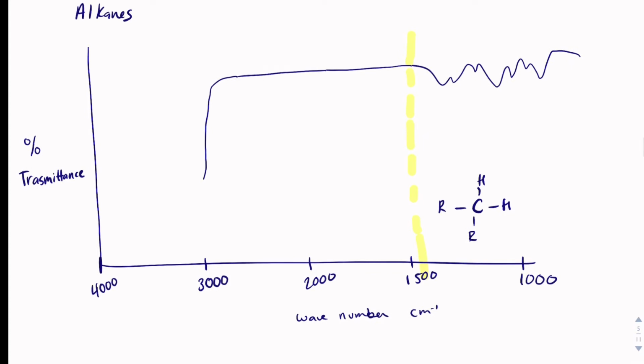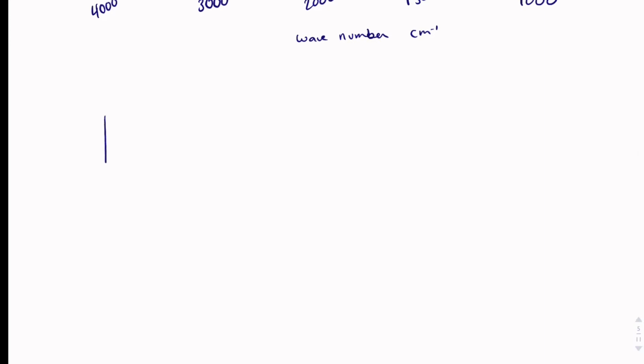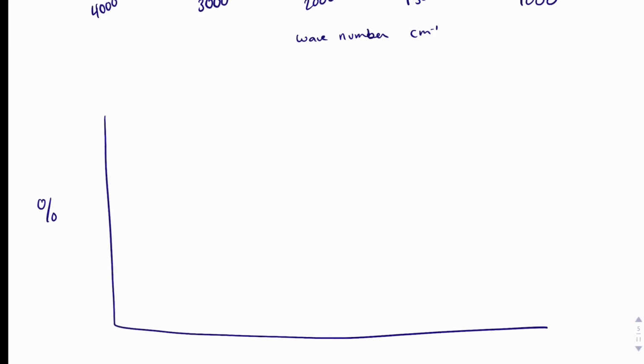At around 2900 to 3000, you'll see some squiggles, and it might look like this. This is what we call alkane stuff. I don't know if that's a very scientific term, but that's what I call it. It's basically CH. Notice how I had single bond C, then H. That does make a difference. That's just alkane stuff, no big deal. Typically, we're not worried about alkanes just because most organic compounds are going to have alkanes present. Okay, my second graph. Let's take a second and draw it.